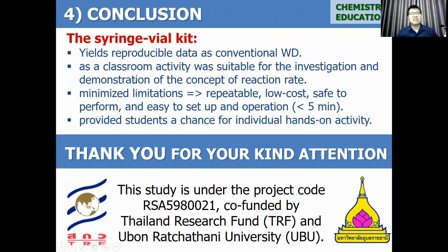Our conclusion is the syringe-vial kit method can yield reproducible data like the conventional water displacement in a burette method. It can be used as a classroom activity, which is suitable for the investigation and demonstration of the concept of reaction rate.